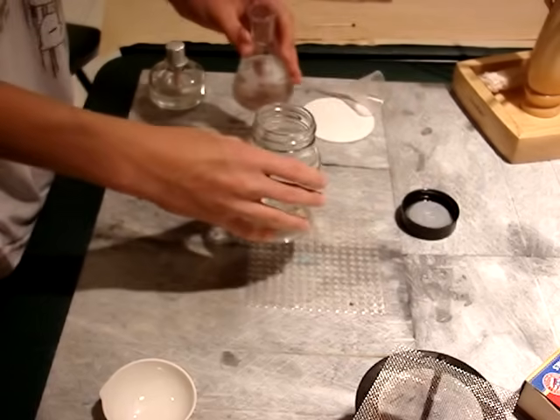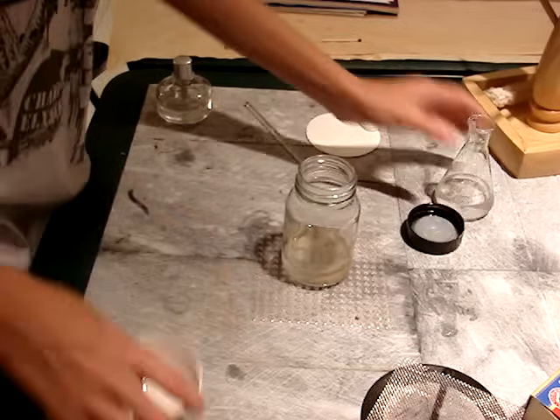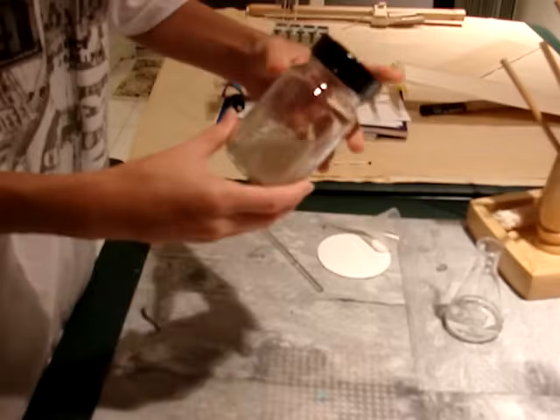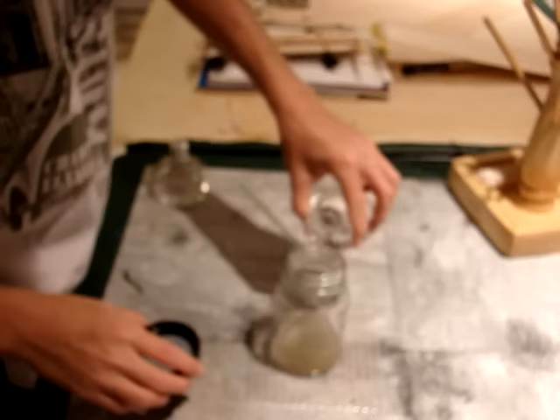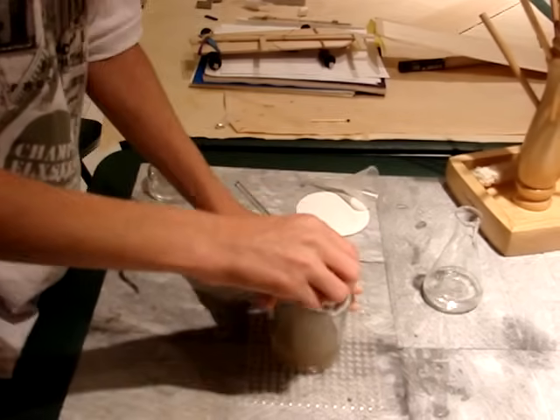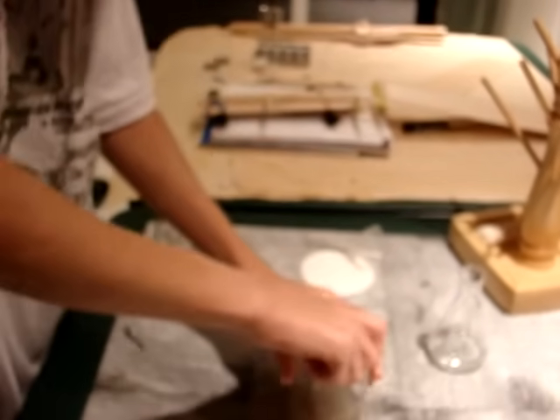Okay, so the first step is to pour some water in here to be able to dissolve the salt in the mixture. Oops. I'll cover it with this screw lid and shake it up. It seems we need more water. Okay, and this looks okay.